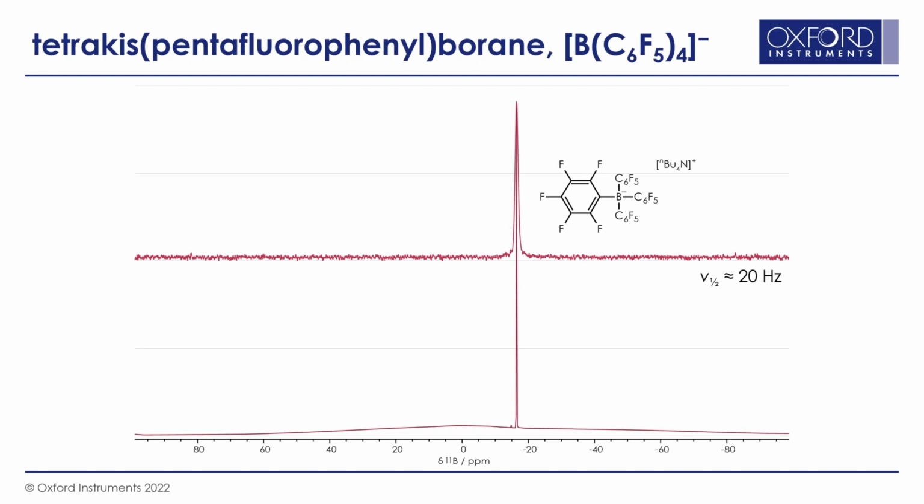There's one more thing to notice about these spectra. While the data collected on the X-pulse has a flat baseline, this is not the case for the data collected on the high field instrument. This is a common issue in boron 11 NMR. Since many glasses contain boron, it's not uncommon to observe a background signal in boron 11 NMR spectra due to glass components of the probe and often the NMR tube itself.